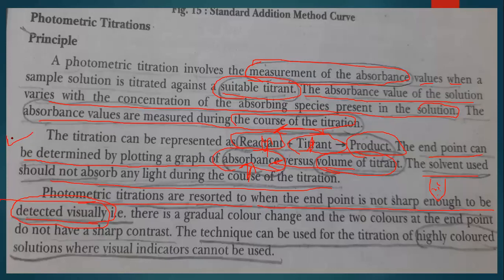For such a titration we are using the photometric titration, not thermometric. It's a photometric titration. Thermometric titration we are going to learn in S.Y.B.Sc. Sorry, that word came by mistake.